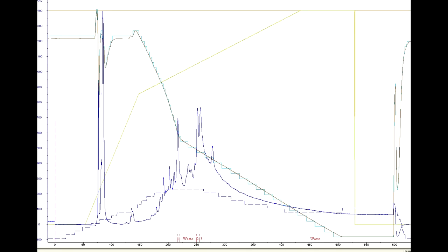Looking at the x-axis there, we see that there's three fractions that were collected. And how I know this is because of the marks for 1, 2, and 3 there with a waste in the middle. So how that was accomplished manually through the fraction collector is when the first peak was starting to come out, we would type 10 or a positive number into the message box and hit execute. And then once that peak was finishing, we typed in zero and pressed execute, changing it to the waste.